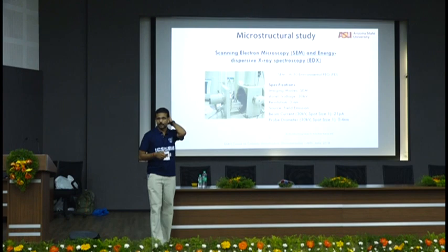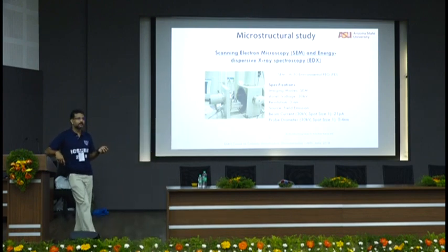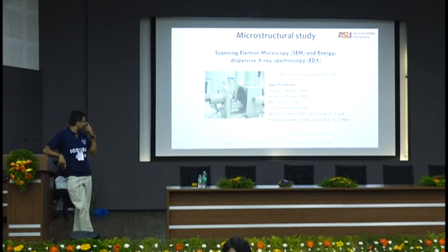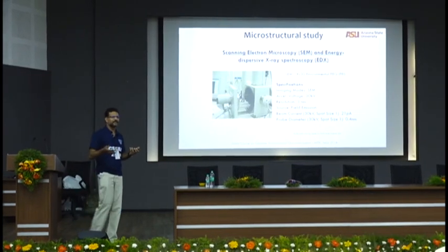So we'll do some SEM now, because a lot of people ask questions about SEM. I added this last night to give you a little more flavor of what you can do and what you can get with SEMs. So this is a scanning electron microscope. Scanning electron microscopes come in different forms.